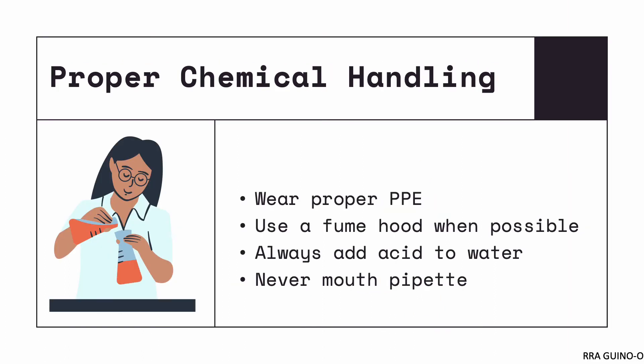Next, let's talk about rules for proper handling of chemicals. First and foremost, wear your proper PPE when handling chemicals. If you have a fume hood, always use it whenever possible, especially if using chemicals that produce a lot of vapors. If you don't have a fume hood, handle chemicals in a well-ventilated area to minimize risk. When mixing chemicals, always add acid to water and not the other way around, to prevent splashes. And finally, never mouth pipette.